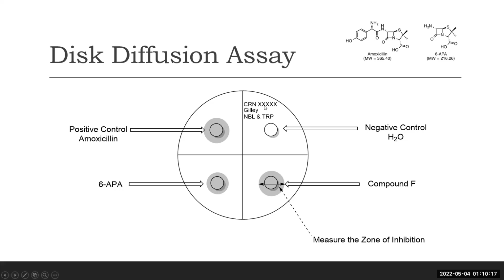So when we get our plates back, hopefully they'll be labeled properly, so we'll know whose class the plates came from since there are multiple sections of 233L. And then also have some initials on there so that you know whose compound was tested on this particular plate.